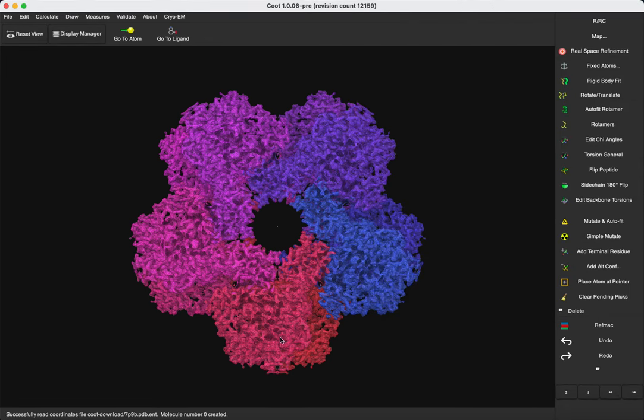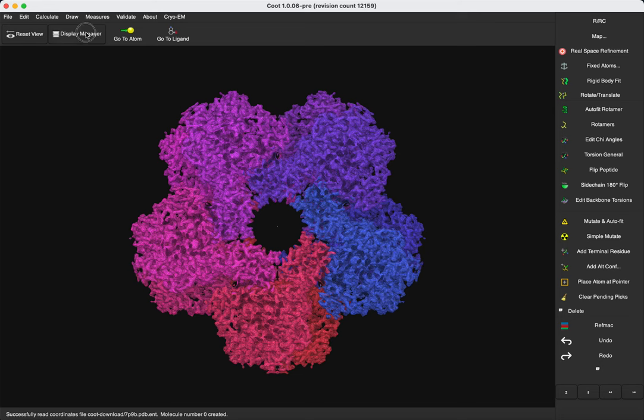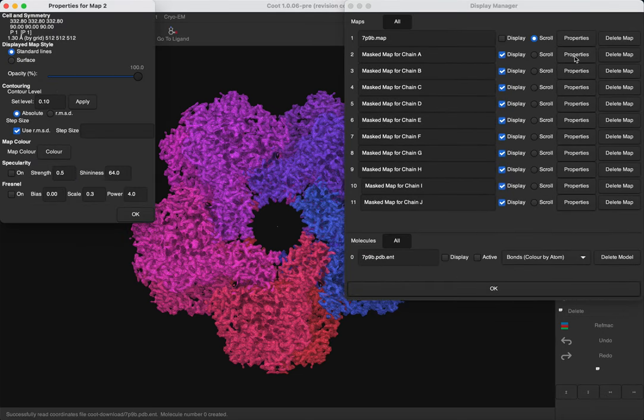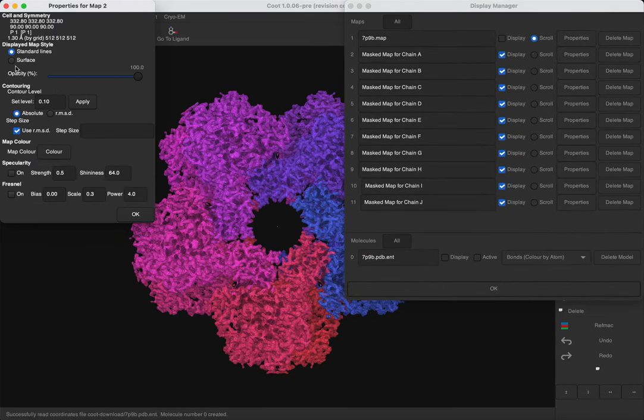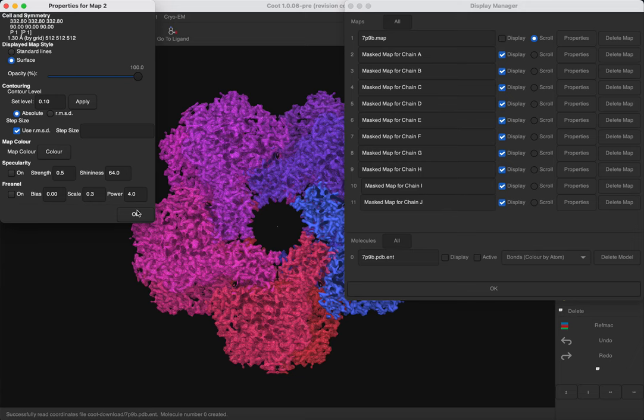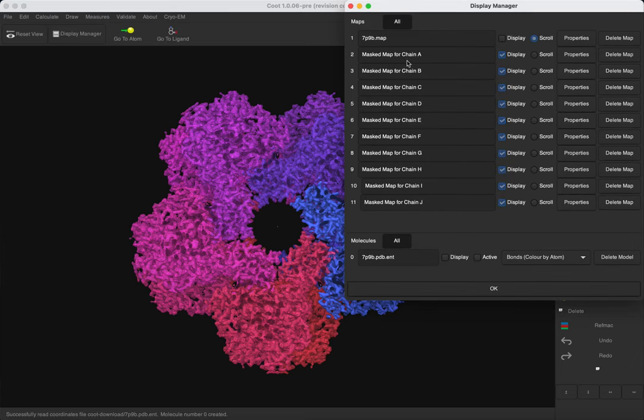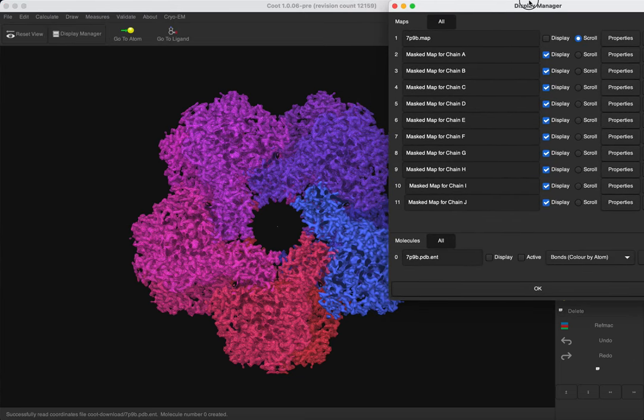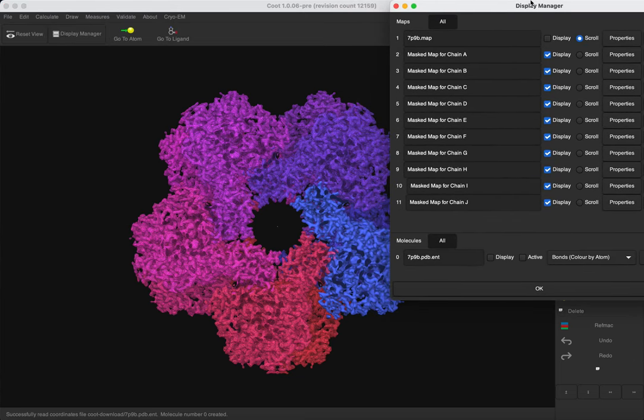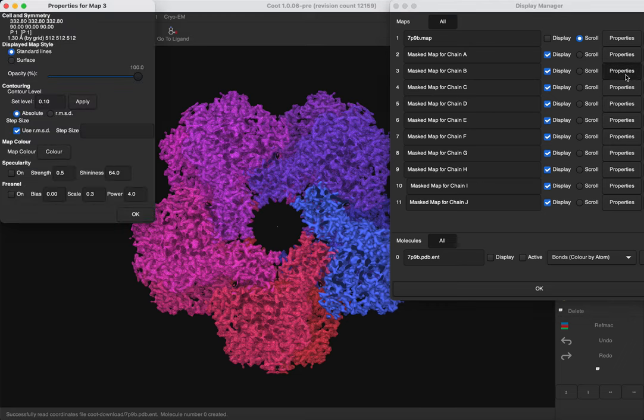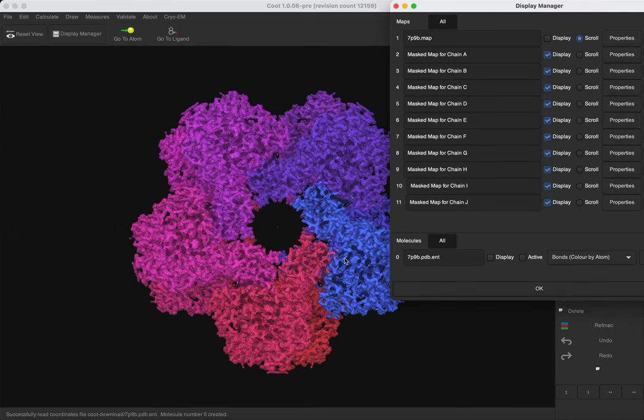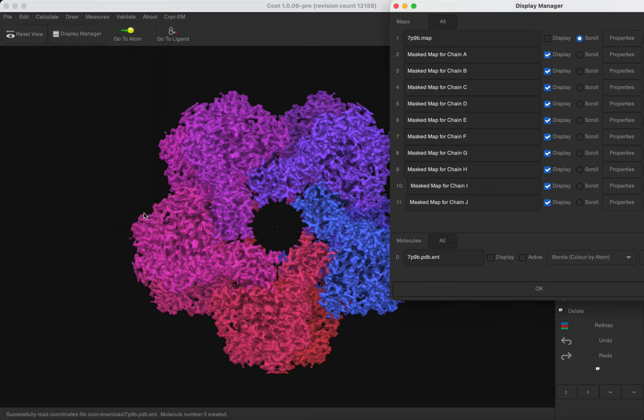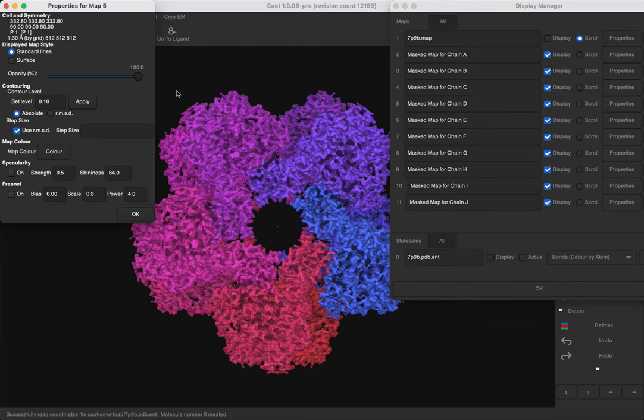And now we want to make each map masked for each chain as a surface. So we need to click on the properties of each masked map for each chain, and tick the surface option. This can be a little bit tedious, but I will show you that there is a Coot function in Python that can make as a surface all the chains.